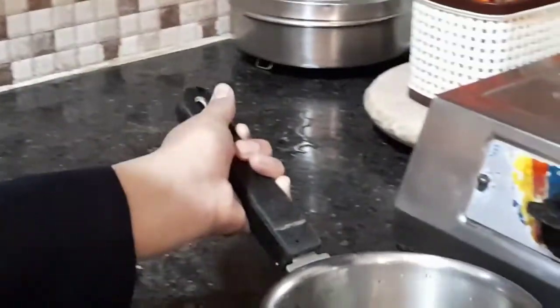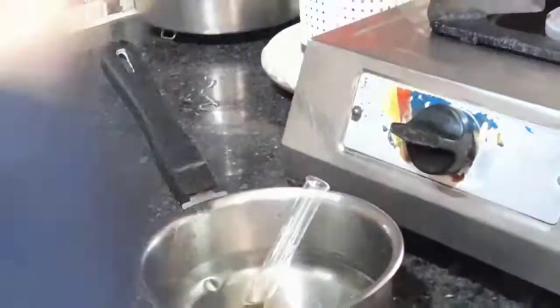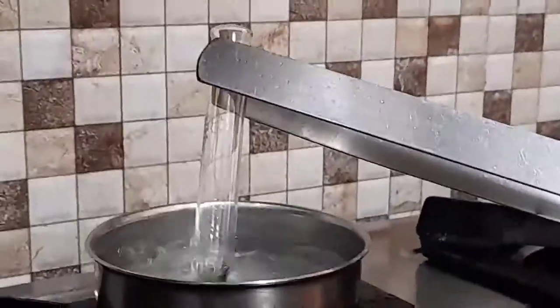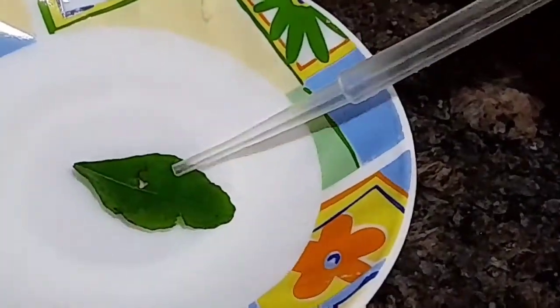Now I am going to put it in water and then we will heat this. Now we are boiling the isopropyl alcohol. You can see after boiling it in isopropyl alcohol, it has turned light green.